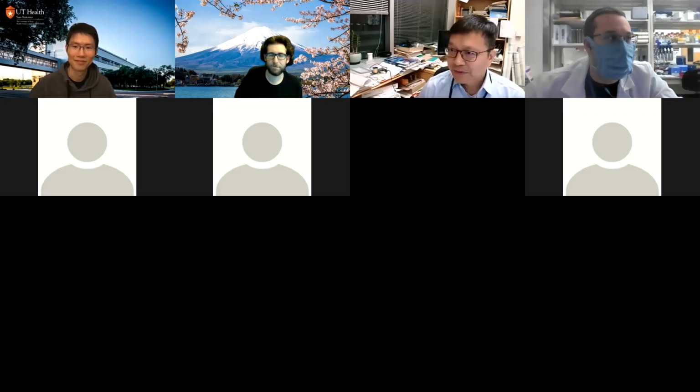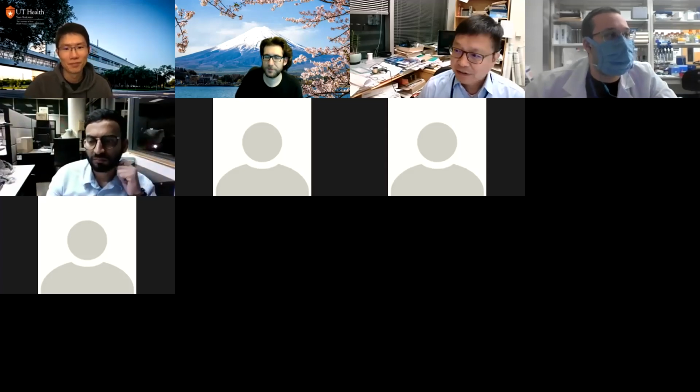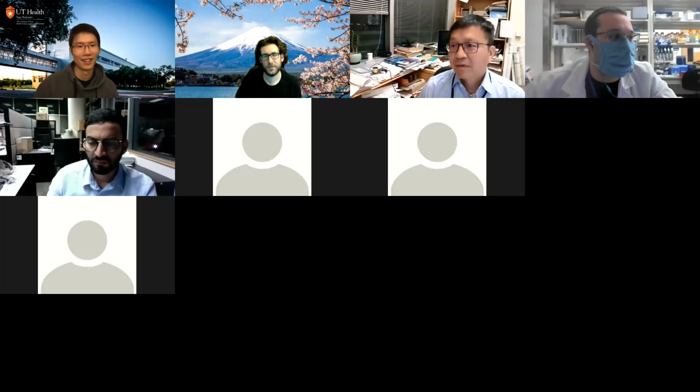Hey, just one more. Sorry about that. Again, looking at the quant.sf, I'm seeing quite a few rows where the TPM is non-zero, but the NumReads is 0. Is that just because the number of reads is so small that it's past the decimal points it displays? Oh, that's a good question. So you mean the number of reads is 0, but the TPM isn't? Yeah, it's up to a couple of hundred. It's probably for very short transcripts, maybe.